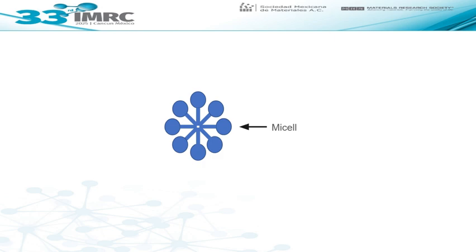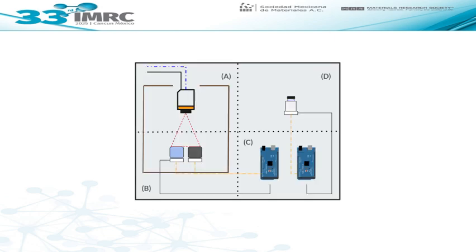Well, to study these interactions in the surfactant aqueous solutions, we propose the next arrangement. This diagram explains our arrangement in four zones. In zone A, we have our IR camera that measures the sample and a reference body.